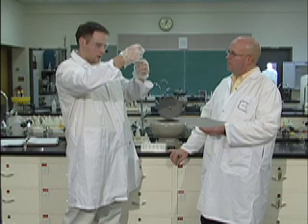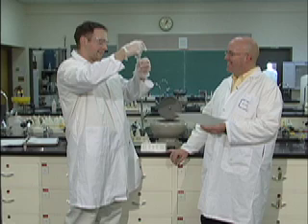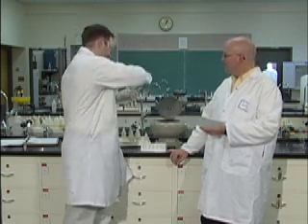And what should we get? A flocculent precipitate. I know that's your favorite word of the day. It is my word of the day. You get some flocculence. A flocculent precipitate.